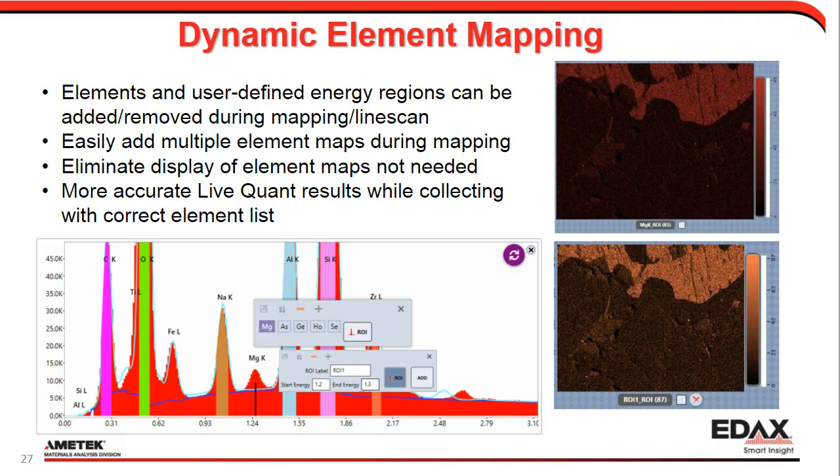New element maps will show up in the multi-map view window automatically, and you don't need to manually delete the element maps from the window.